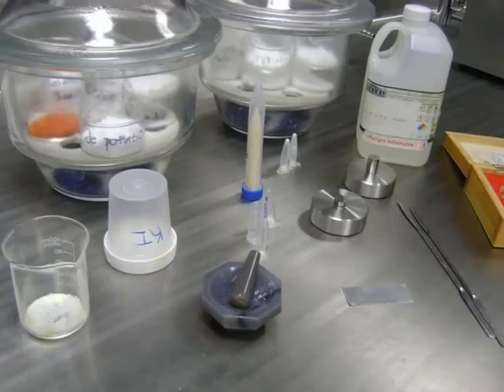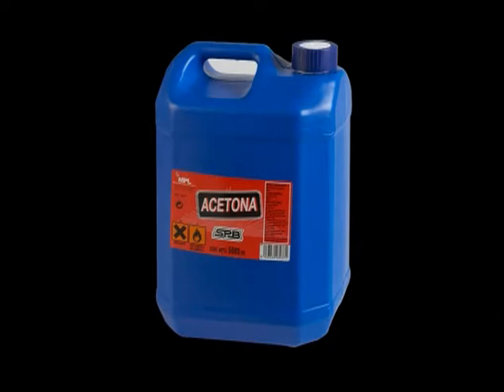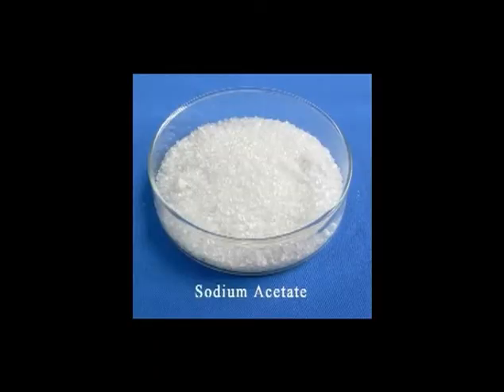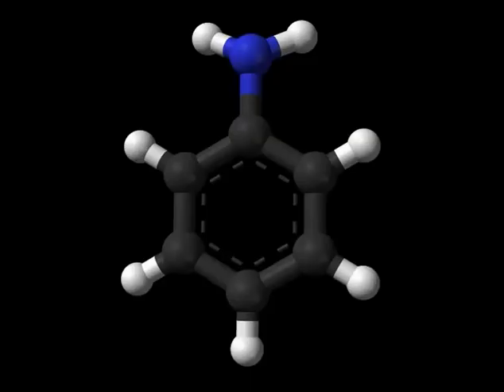Experimental part. Materials: agate mortars, FTIR spectroscopy, cell of sodium chloride, industrial grade acetone, Pasteur pipettes or capillary tubes. Reagents: potassium bromide, sodium acetate, benzoic acid, ethanol, aniline.